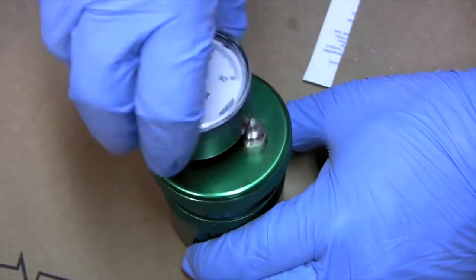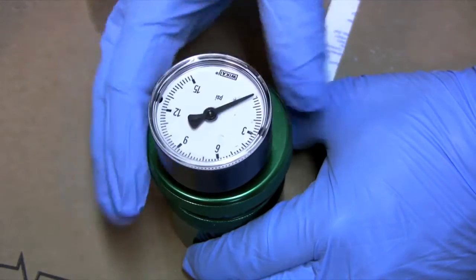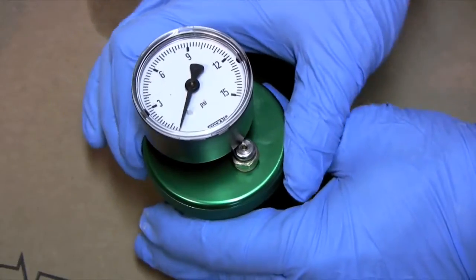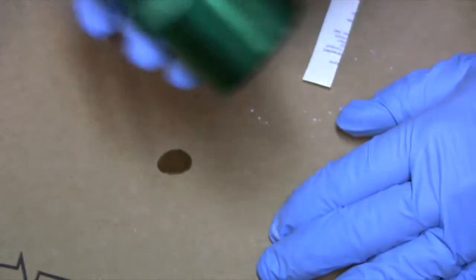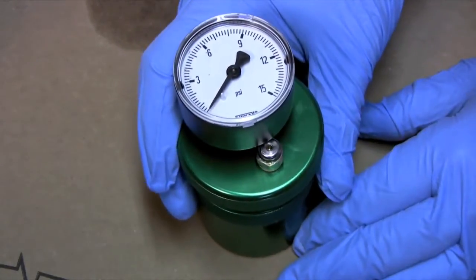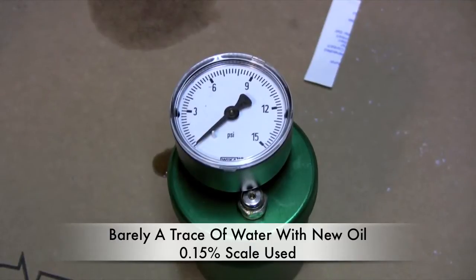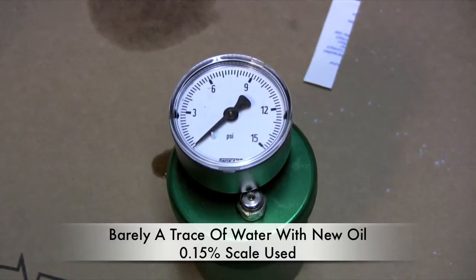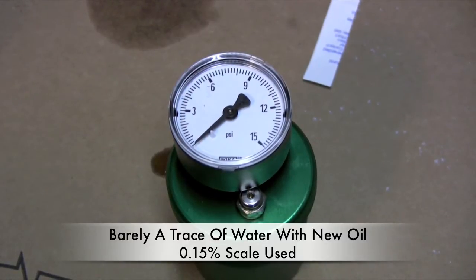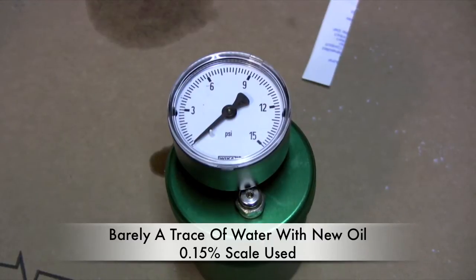I'm going to screw the lid on, pick it up, shake it, and then put it back down. We've let this run for a little bit, and as you can see, this has practically no water in it. This was brand new vegetable oil that I used, so I'm not surprised — the needle is just barely coming up off of its mark. So this is a sample of new oil: no water.